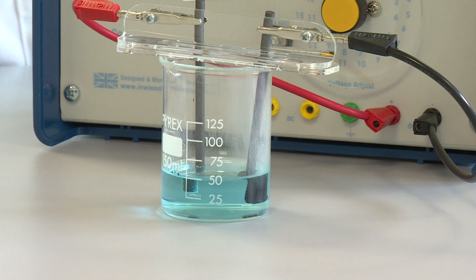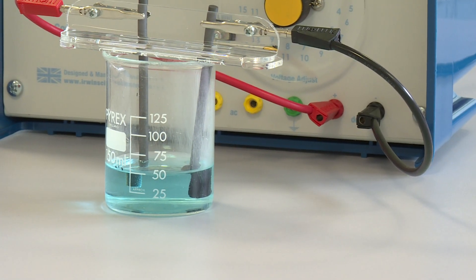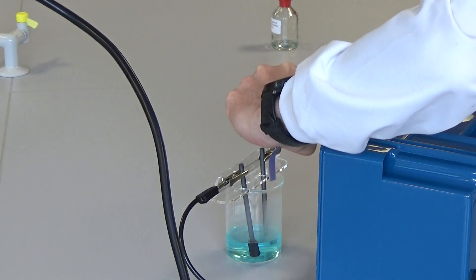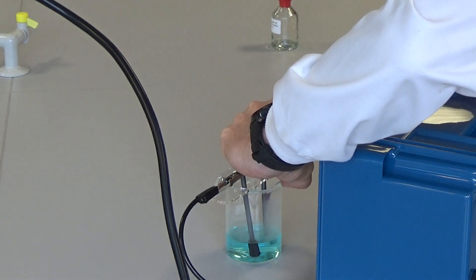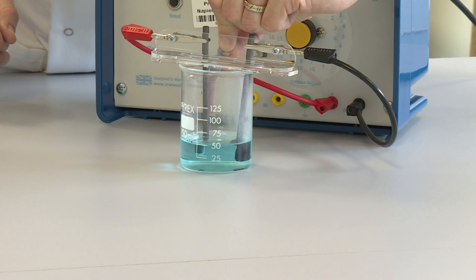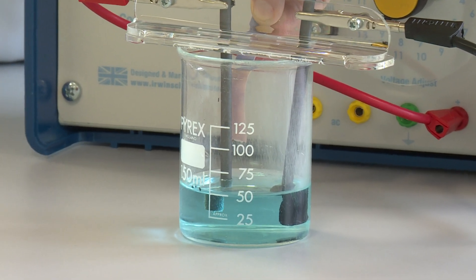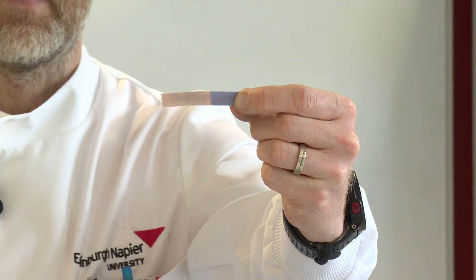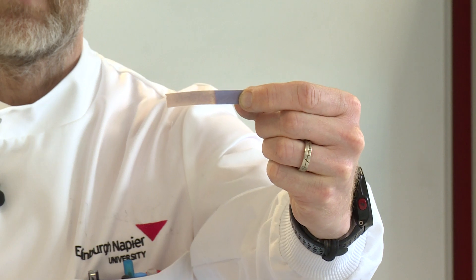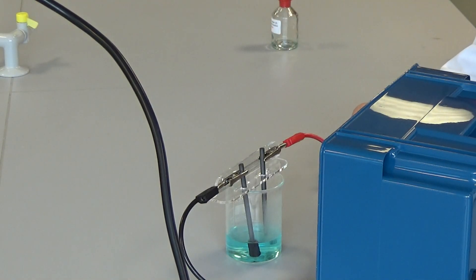We can confirm that it's chlorine gas being produced at the positive electrode using some moist blue litmus paper. Chlorine gas will bleach moist blue litmus paper. If I hold that just above the electrode, you can see already that the blue moist litmus paper has bleached, confirming that it's chlorine gas that's formed. And by gently wafting you'll get the characteristic chlorine smell as well.